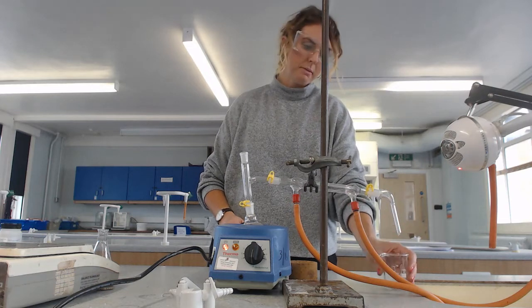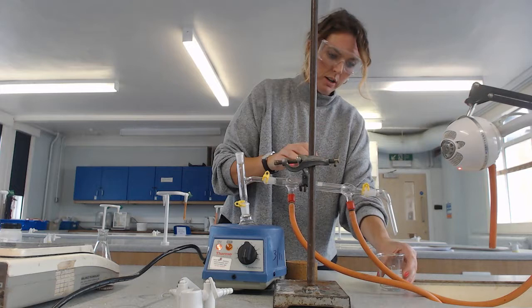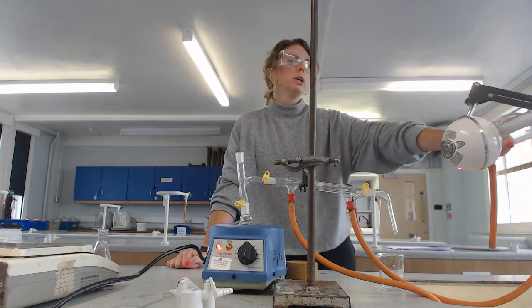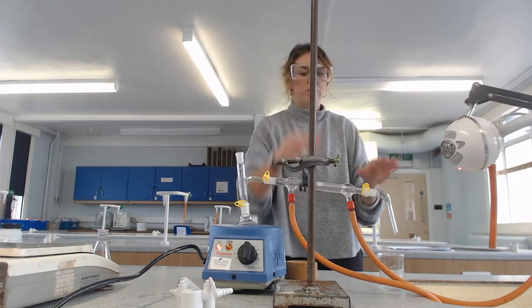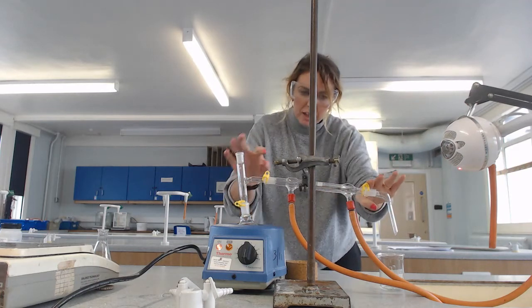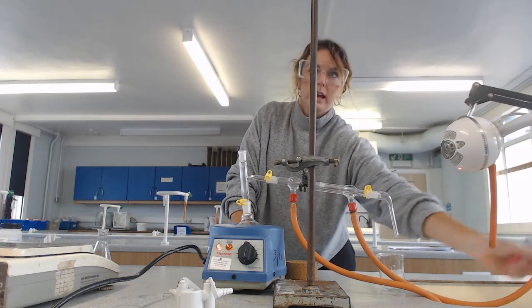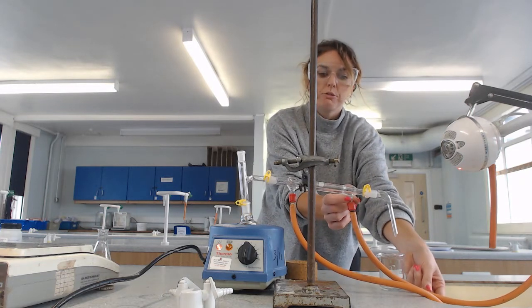At the other end I need something to collect my condensed purified product. I drop my Liebig condenser tube in here and that is hooked up to the taps. There should be a slight gradient — you can see this goes down — and the water should go in at the lowest point.